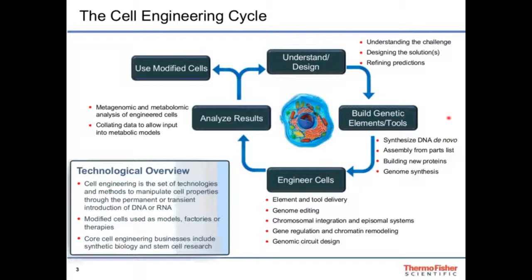As we get to the building of the genetic element editing tool, we use a lot of synthetic DNA synthesis that allows us, as we'll show you, to build the actual tools that go in and edit the DNA. It also allows us to build the donor DNA that we use to repair or replace some genetic elements within the cell. As we move to engineer the cells, we look at delivering these tools.